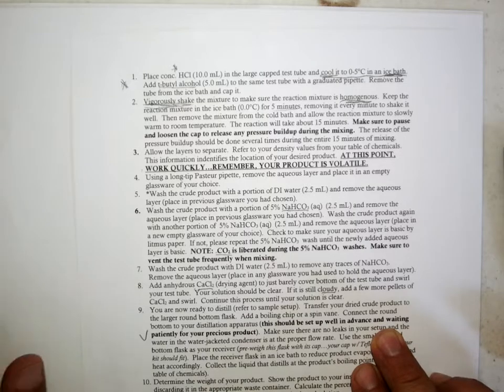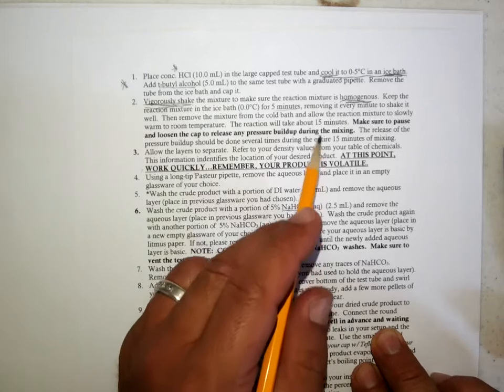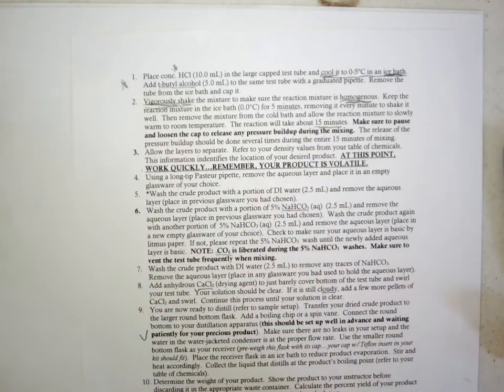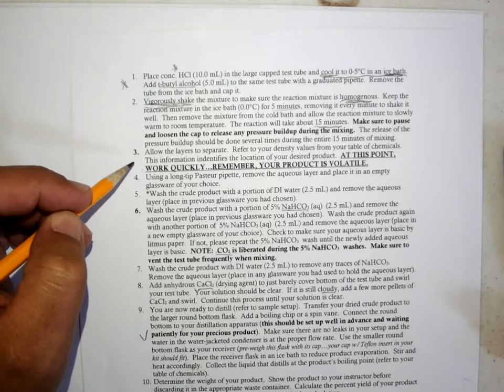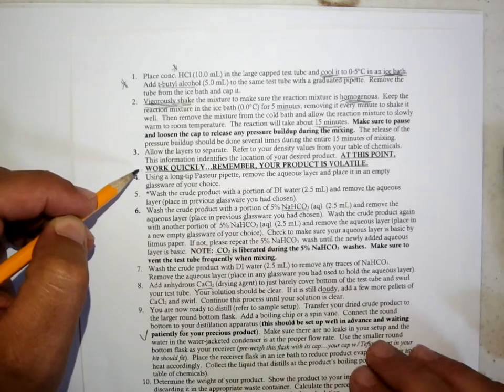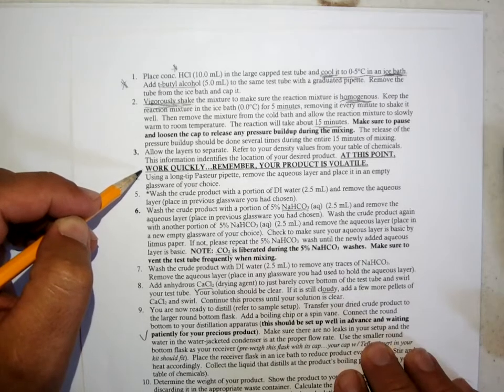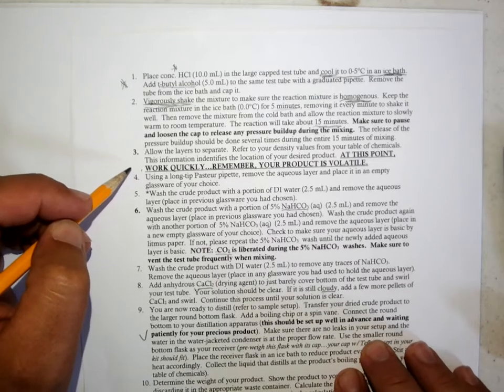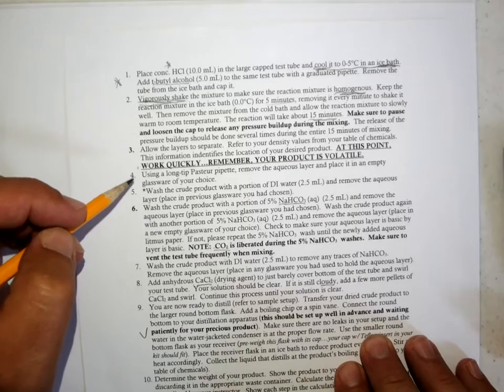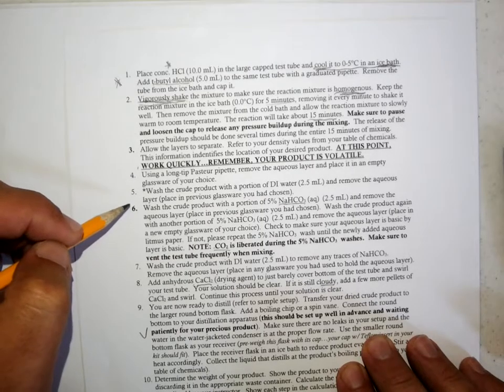This reaction and the important separation will occur over typically a 15 minute period. The organic materials will float to the top, and the things that dissolve in water will go into the water and be at the bottom. The product boils at a fairly low temperature, so it will be evaporating the whole time that you're trying to work it up. That's why this big underlined bold all caps is screaming at you to work quickly, so you're going to want to know ahead of time what you're going to do and prepare your materials so you don't have to be running around the lab while your product evaporates.